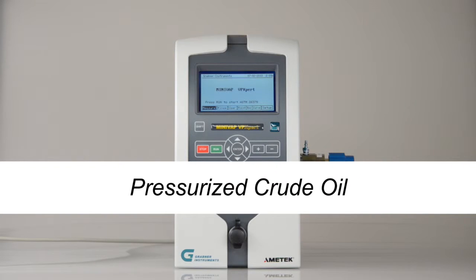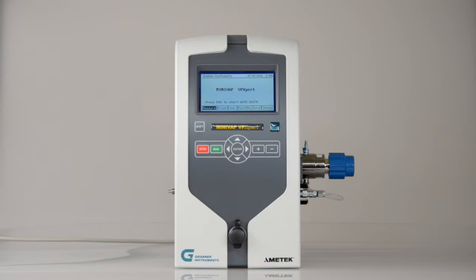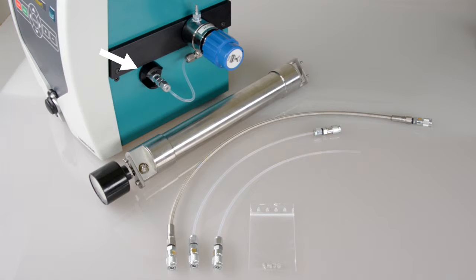Pressurized crude oil. For pressurized crude oil containing volatiles, Grabner Instruments offers a specially designed crude oil package. The package contains a special sample inlet and a pressure regulator to protect the pressure sensor in the VP Expert. The FPC, the Grabner Instruments floating piston cylinder, is designed for pressures up to 7,000 kPa. The package also includes a stainless steel tube for pressures up to 7,000 kPa, a filling tube for pressures up to 2,000 kPa, a filling tube for regular samples, and spare filters for the FPC.